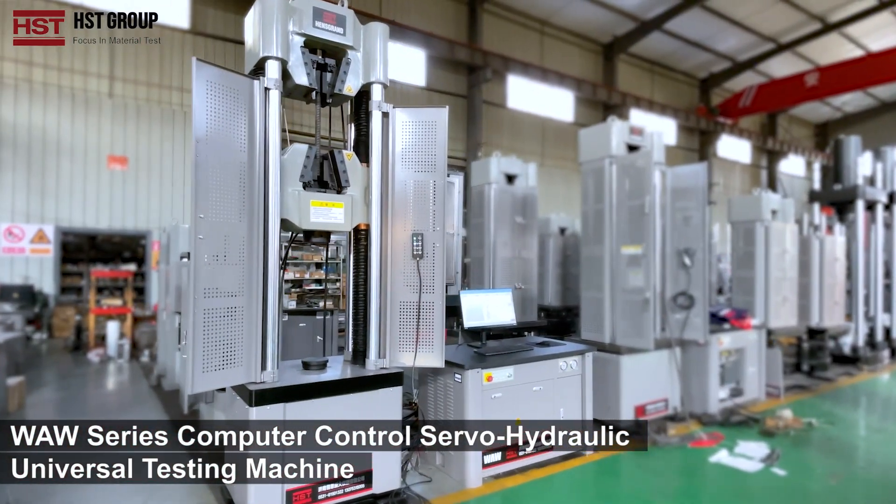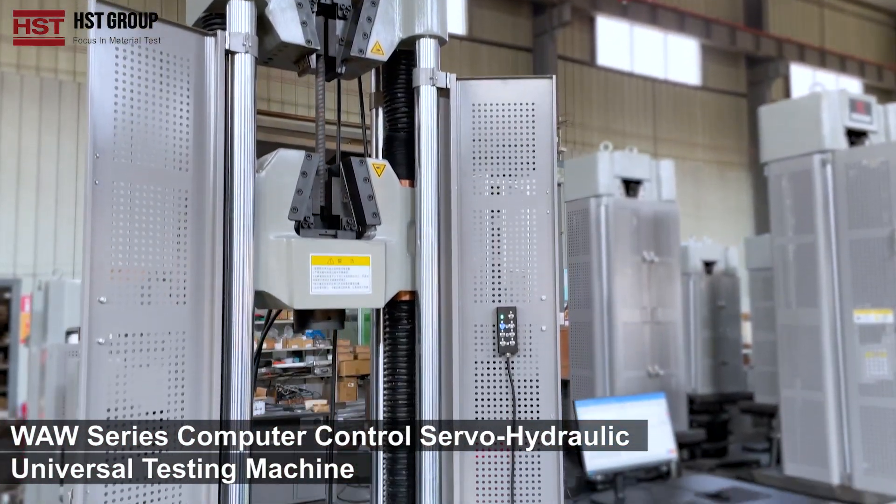WAW Series Computer Control Server Hydraulic Universal Testing Machine.